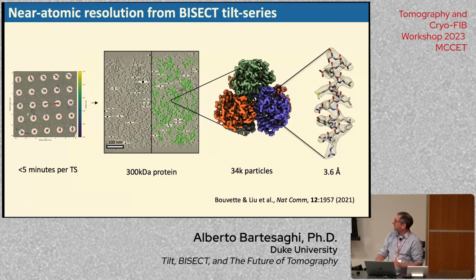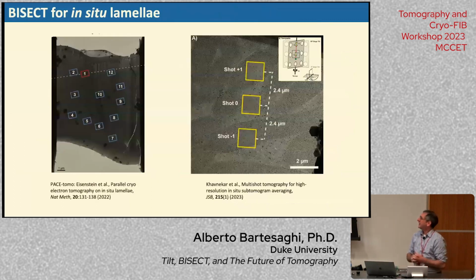So this is already a couple of years ago, and subsequent to this, this BISECT technique was also applied for imaging lamella, some in situ samples on lamella.